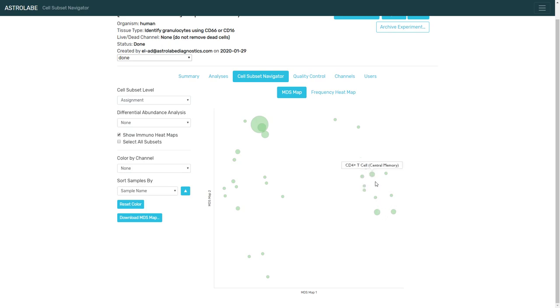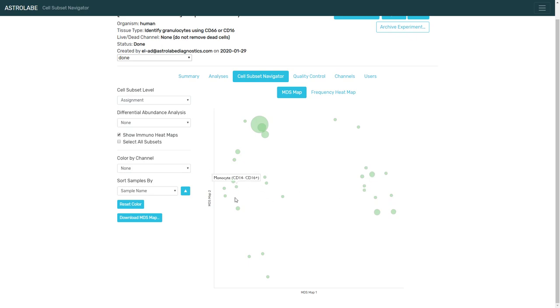So each of these bubbles is one of the cell subsets. So you can see we have different T cells, we have different NK cells, monocytes, B cells, and a large group of granulocytes at the top, neutrophils, eosinophils, and basophils.